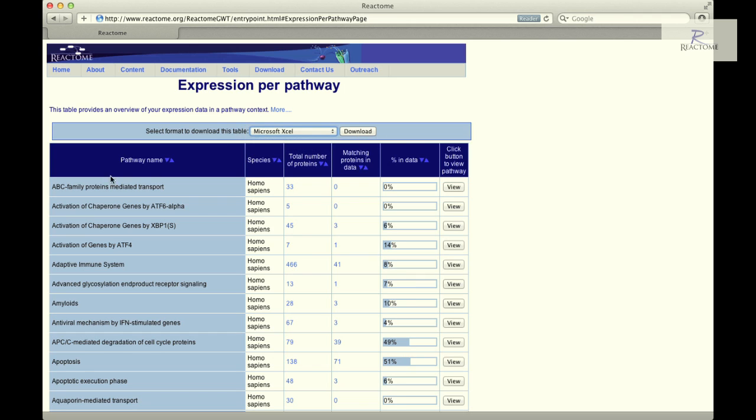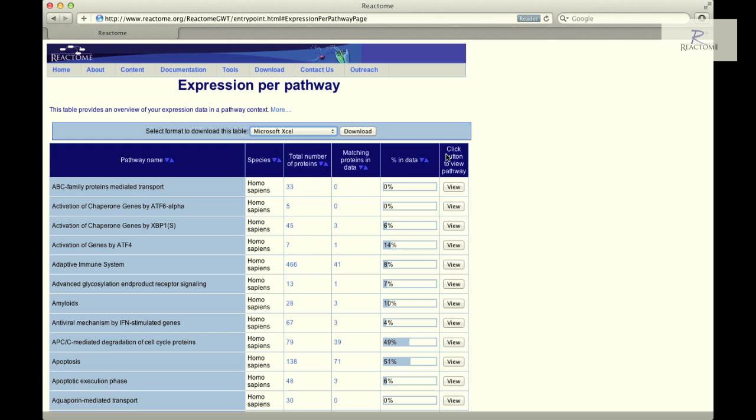The sortable table contains one row for each Reactome pathway and six columns: the pathway name, the species, the total number of proteins in the pathway, the proteins in the pathway represented in the submitted data, a graphic representing the ratio of the values in columns three and four, and finally a View button that launches the pathway browser and displays the relevant pathway diagrams.